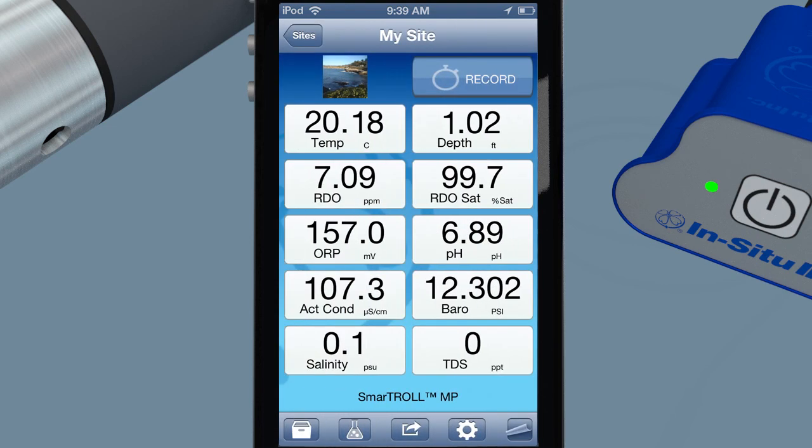Access in-app software add-ons such as low-flow sampling from the iSitu home screen. Be smart, be mobile, be in situ. The future is now with the new SmartTroll multi-parameter handheld.